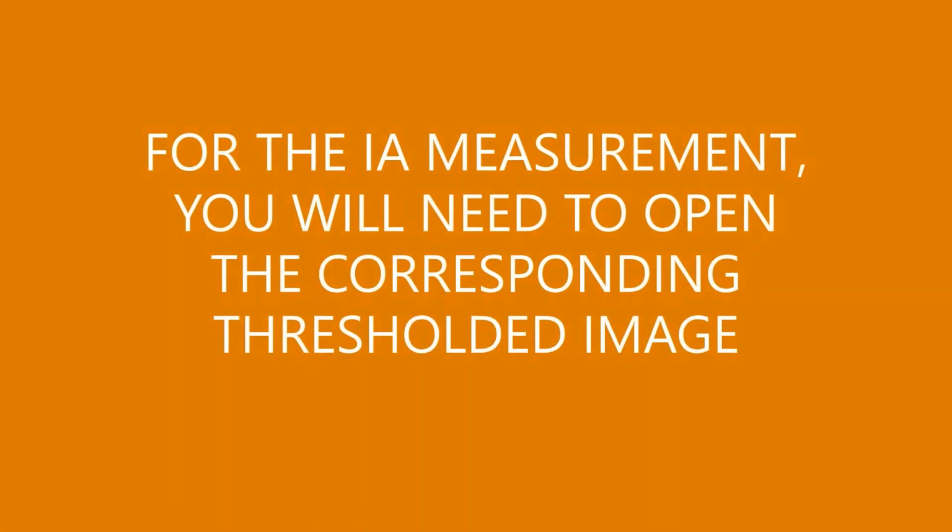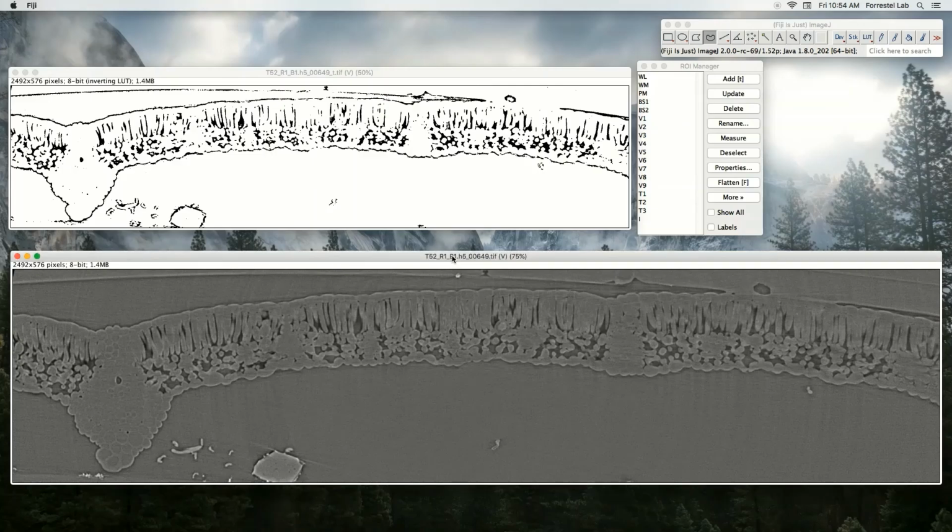For this, we're going to use the combine threshold. Once you open the combine threshold, the same image, the same slice, what you'll do is select whole mesophyll.